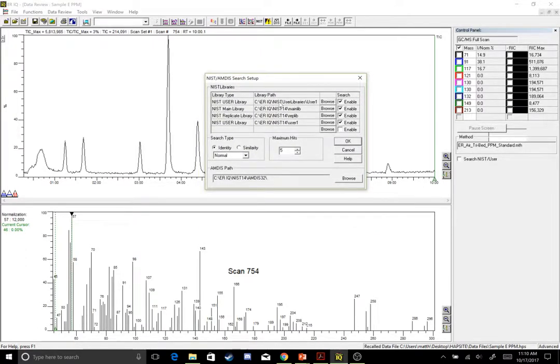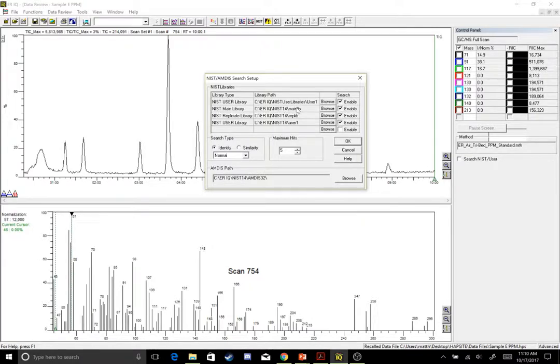This is ERIQ, NIST User Library, User 1, and then the next three are going to come from your NIST 14 library. So the first one I put NIST 14 Main Library, NIST 14 Replicate Library, NIST 14 User Library. These should all already be contained within your NIST software.